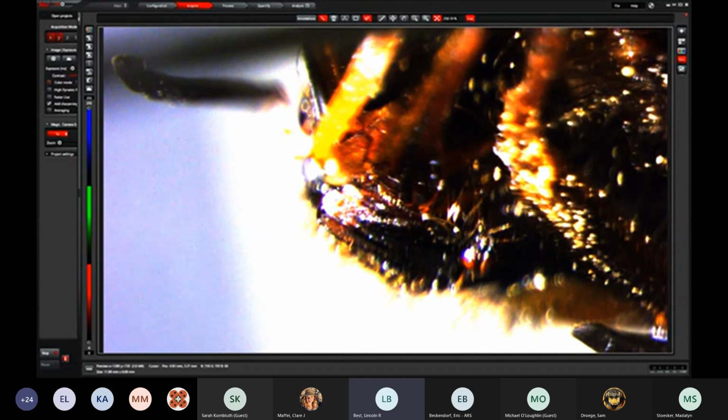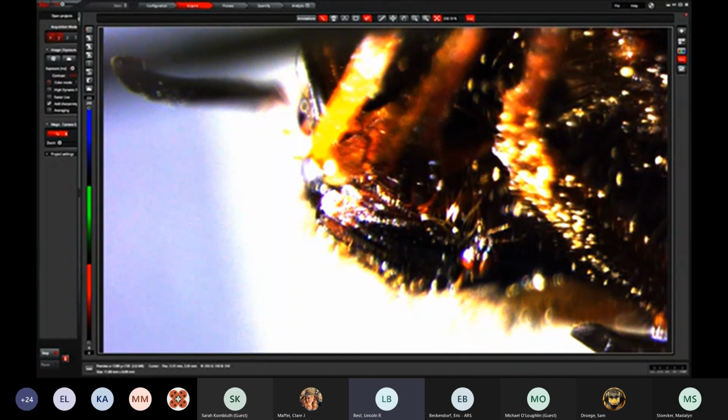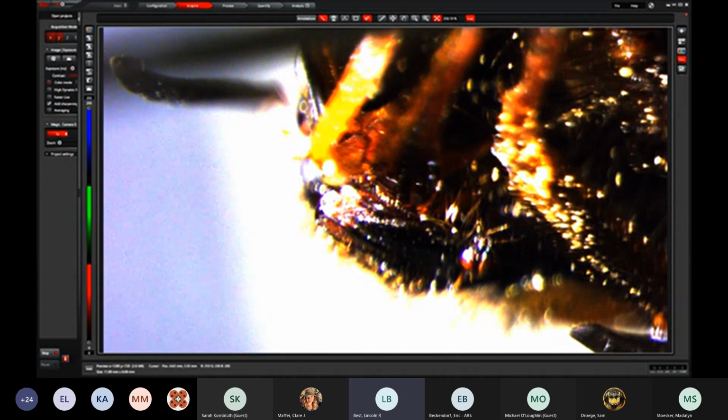Finding these notches is really difficult. Often your specimen is like this, where the left side mandible is buried under the right side mandible, and even the right side mandible is pressed up against the tongue parts, which have some concreted pollen nectar goo, making it almost impossible to see. So you can take your bird pin and see if you can pull on the mandible to get it to stick out a little bit. Of course, you risk that mandible snapping off and firing across the room, or just breaking and shattering off the edge as you pull on it.